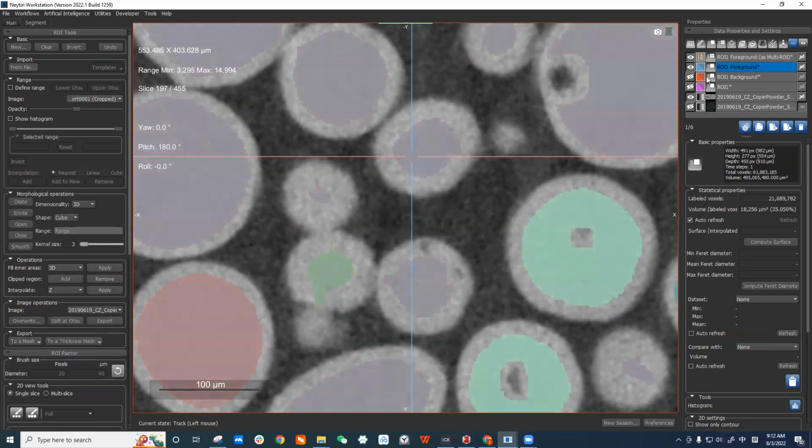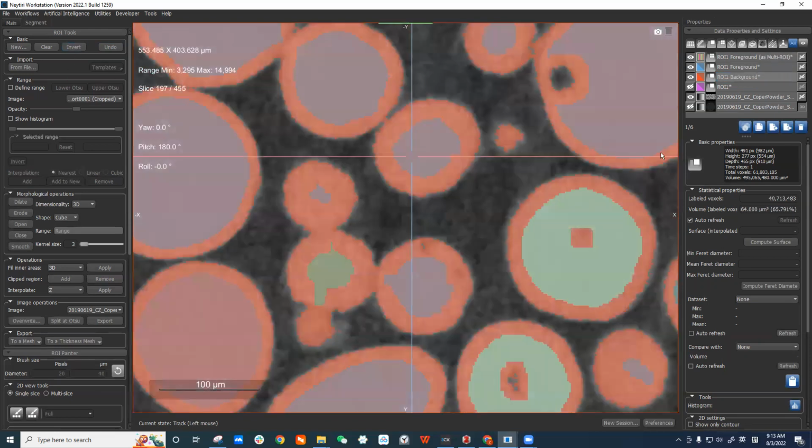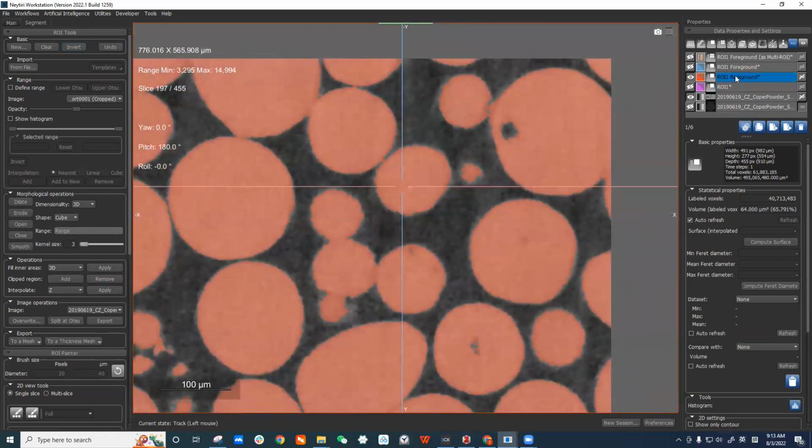That's okay. That's why I should keep my original particle ROI, because I would use that again as a mask for watershed. When I did this, I eroded my ROI, so I don't have the original copy of my ROI. Okay, to get it back, I'm using the background because I don't need the background ROI now, so I invert my background. So I will use this as my mask. This is the same as the original particle ROI, the blue ROI.